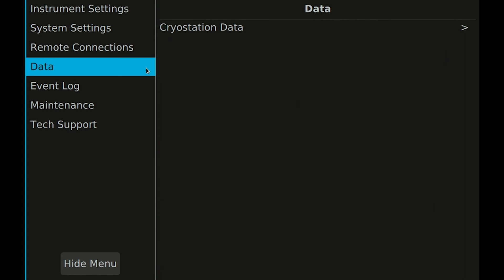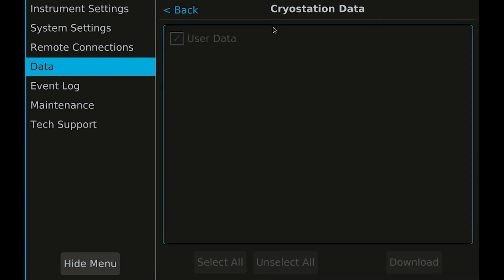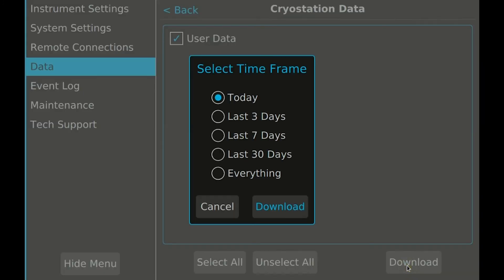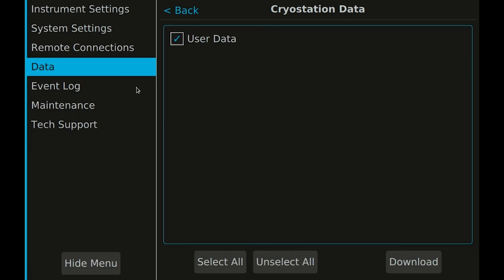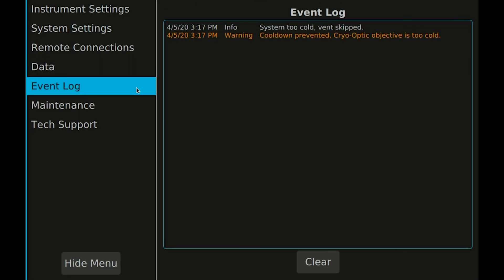The data category is used to download data that is stored inside the system to a USB drive for processing on your computer. Select a time frame for the data to download to your USB drive. The event log shows a history of all messages that have been displayed and is useful for debugging or reviewing what happened while you were away.